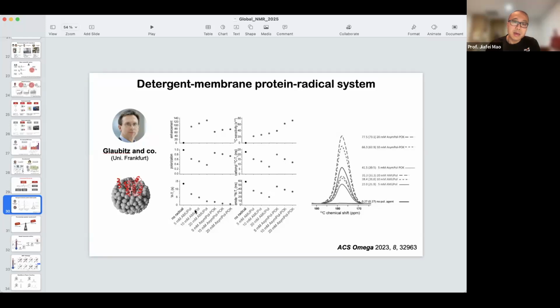What I can really tell is it's a very special case. In this system, Johanna was really praying for sensitivity, even better sensitivity. So it's very necessary to use even a model membrane protein for optimization for her real world application, which is on a GPCR.